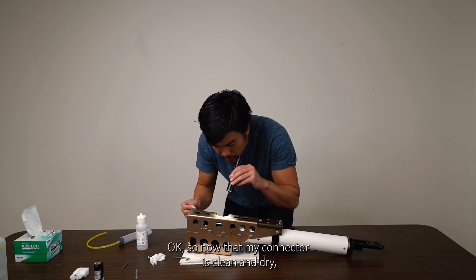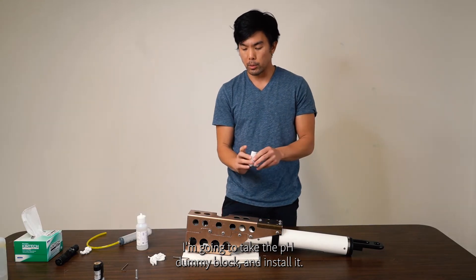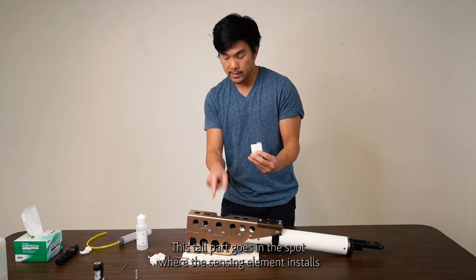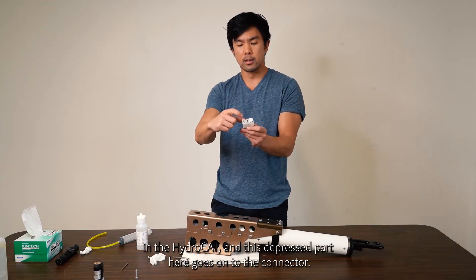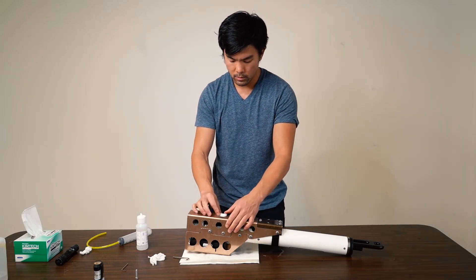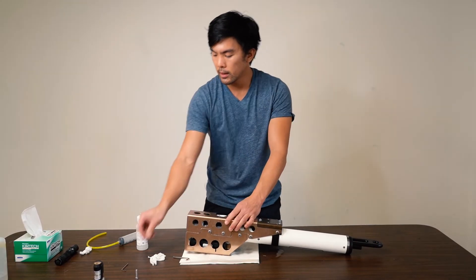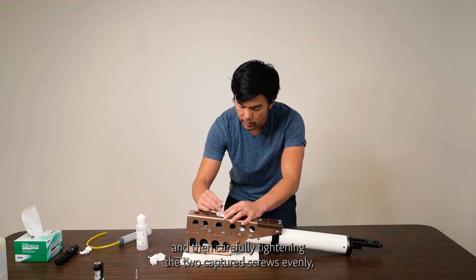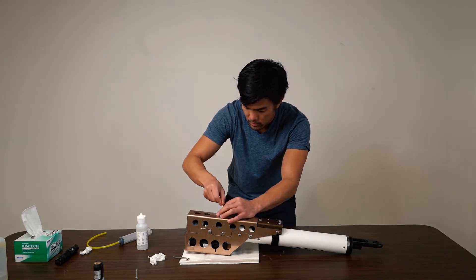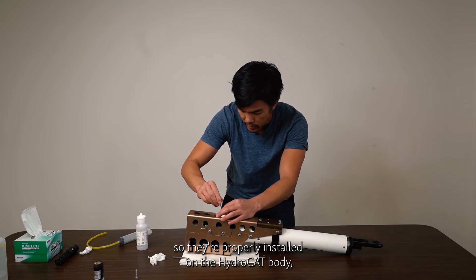Now that my connector is clean and dry, I'm going to take the pH dummy block and install it. The tall part goes in the spot where the sensing element installs on the HydroCat, and the depressed part goes onto the connector. Push it into place, then carefully tighten the two captured screws evenly so they are properly installed on the HydroCat body.